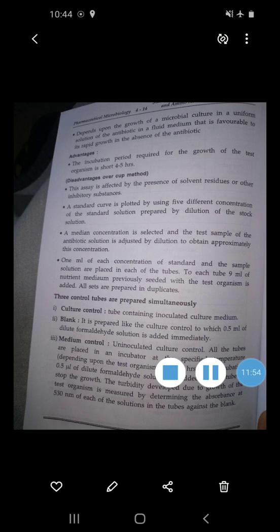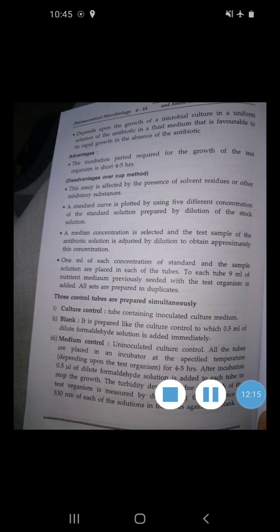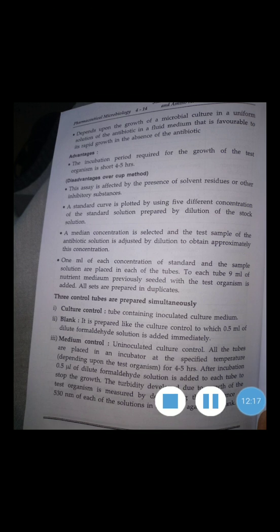Then the test organism is L. arabinosus. This procedure used for turbidimetric assay of L-glutamic acid is based on the titrimetric procedure and conducted with necessary modification. The stock culture of the organism is maintained in a culture medium by weekly transfer and kept in the refrigerator.